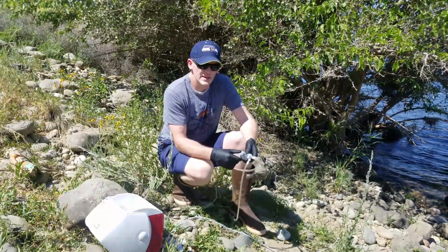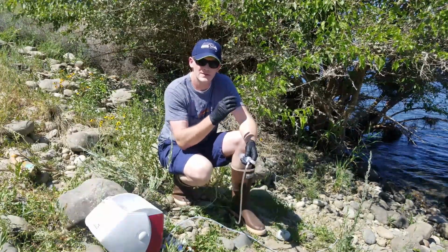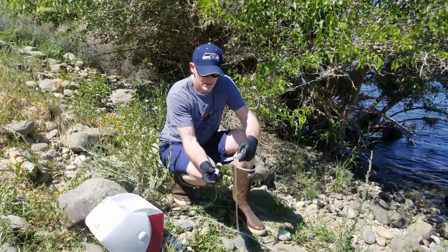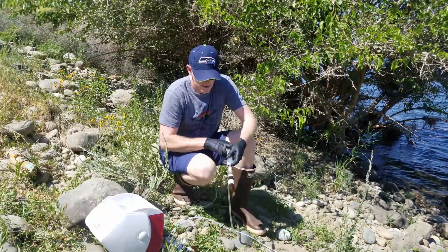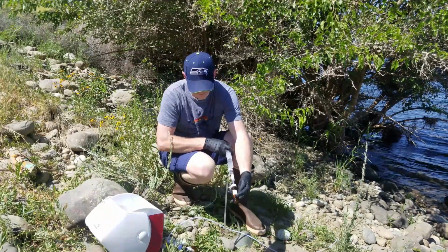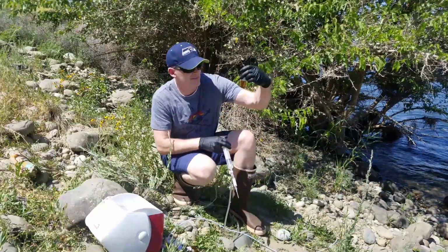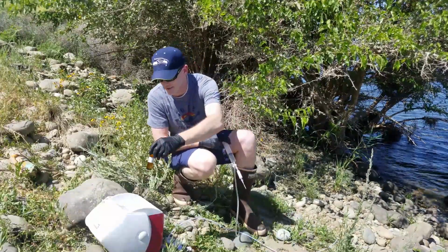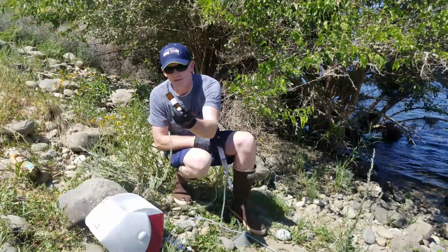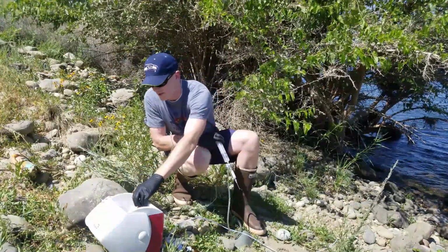Next thing we're going to do is fill an amber vial half full. So each push point is going to get a half full amber vial that is specific to that push point. Amber vial, get the top off, come in, and go half full. A touch more than that, but not much. And then before you put it in the ice, make sure you invert it three times. The reason is there's acid inside this vial, so we're acidifying the sample right away.